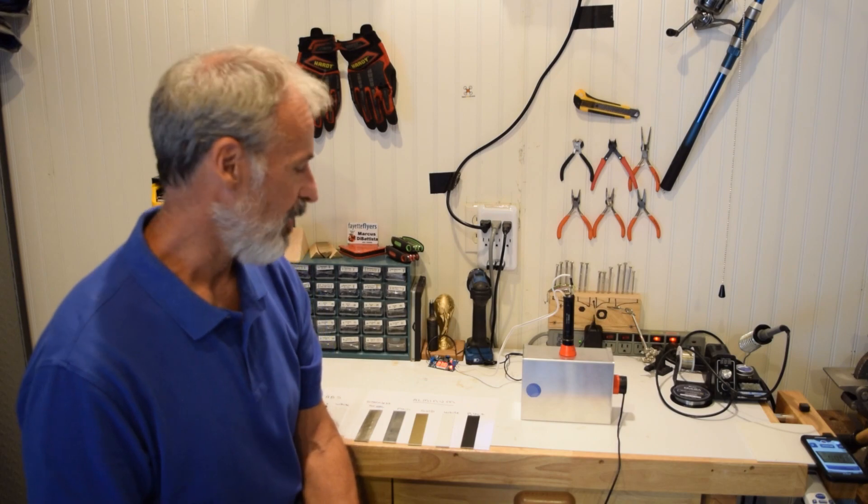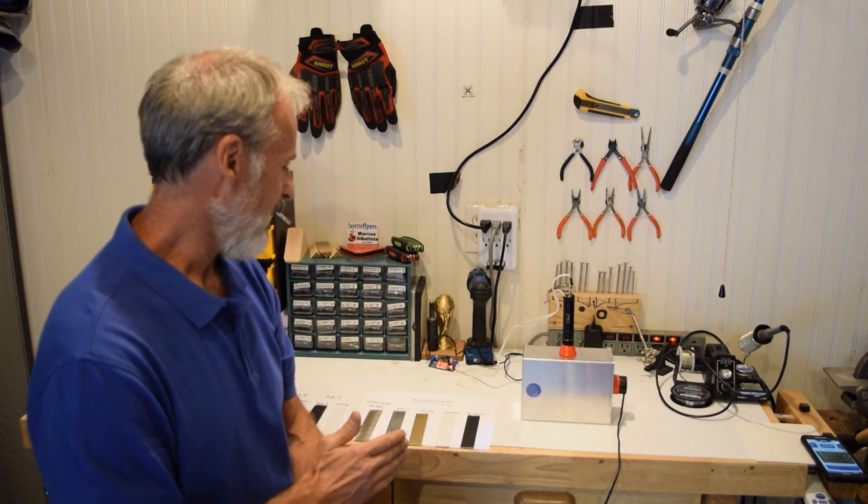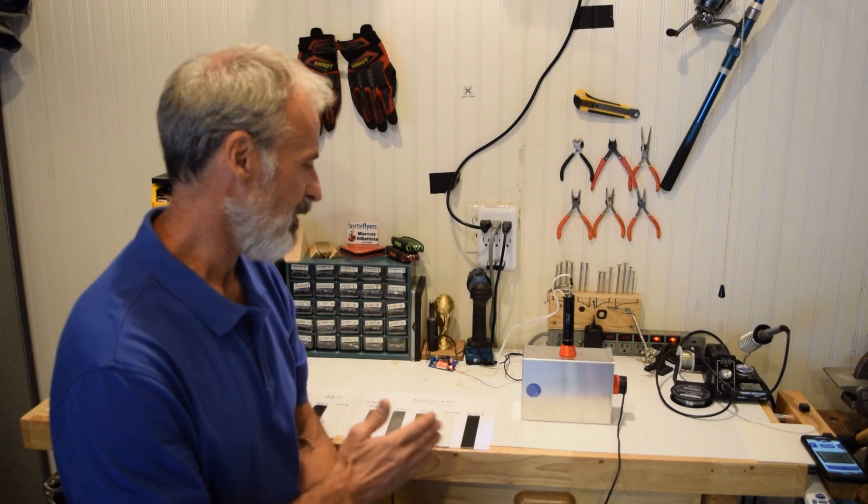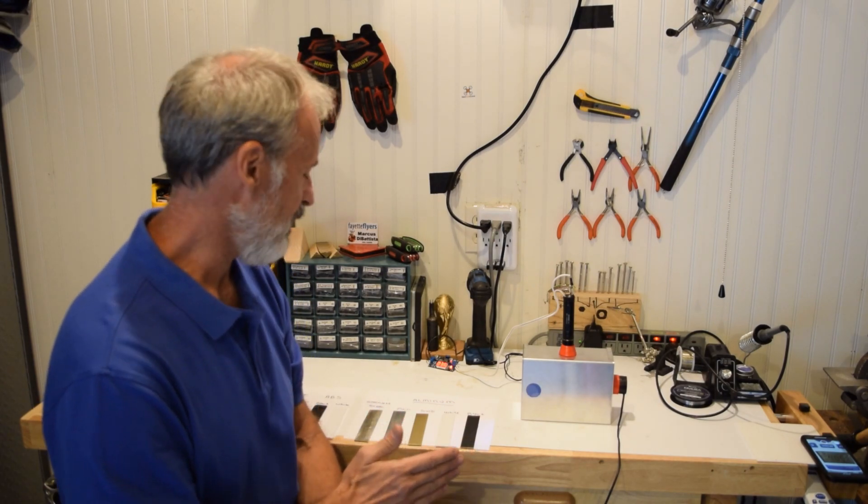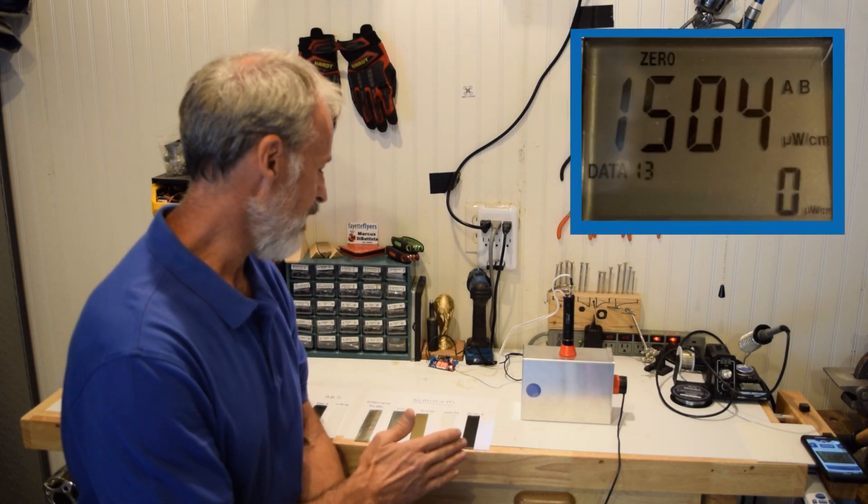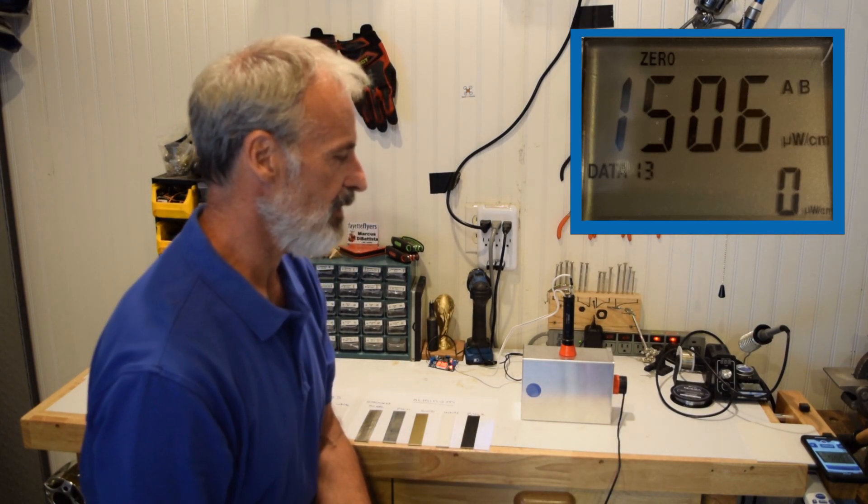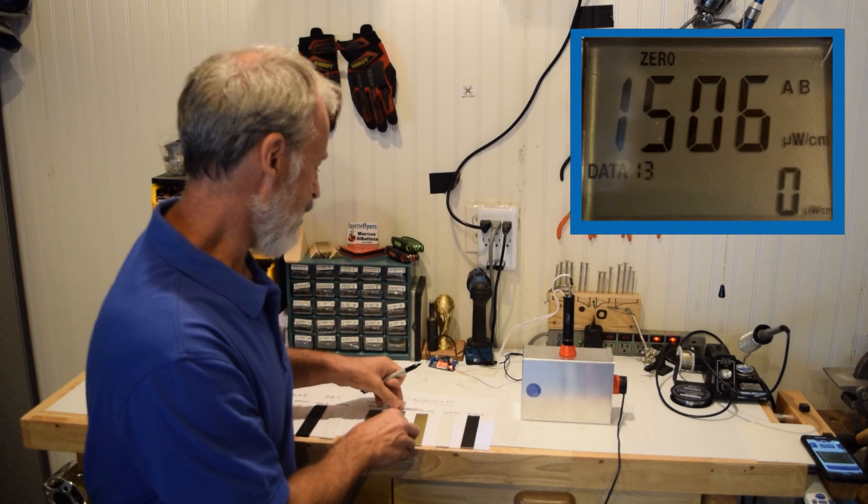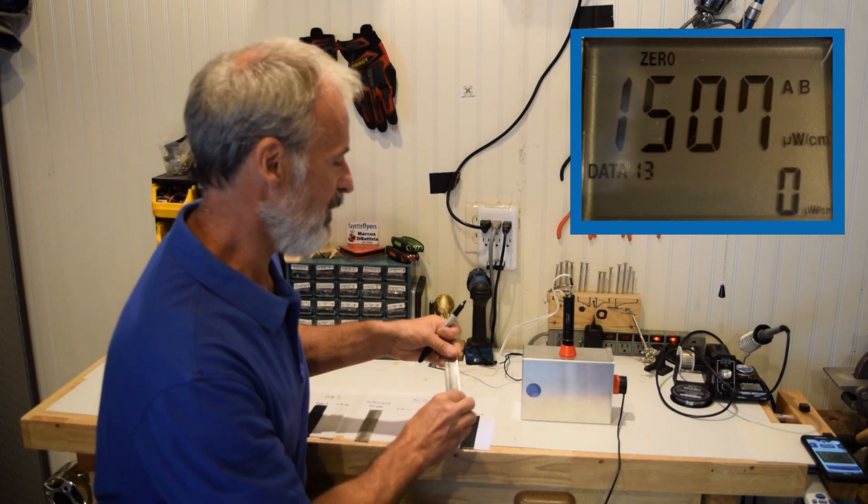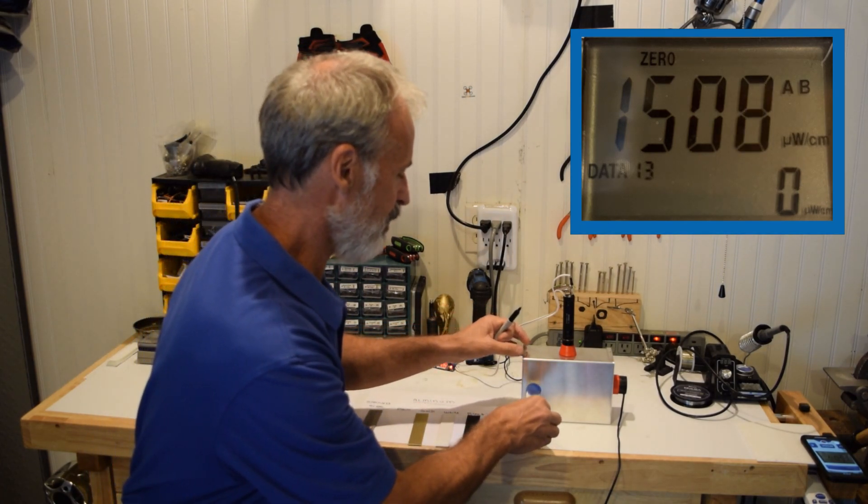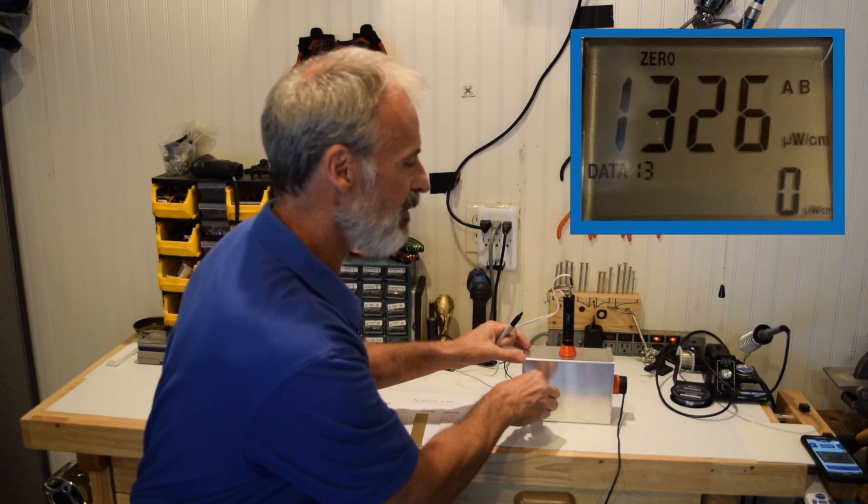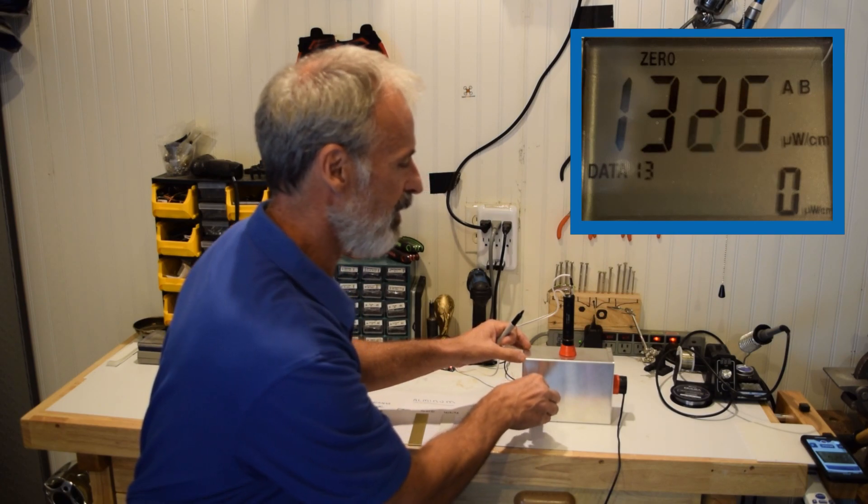First we're going to start with the opaque materials to show the effect of painting and how much absorption you're getting of these different materials. We'll start with the aluminum first. As you can see, we're getting about 1,500 microwatts per square centimeter of energy in the box. We'll slide it all the way to the back. You can see with aluminum, it drops to about 1,325.